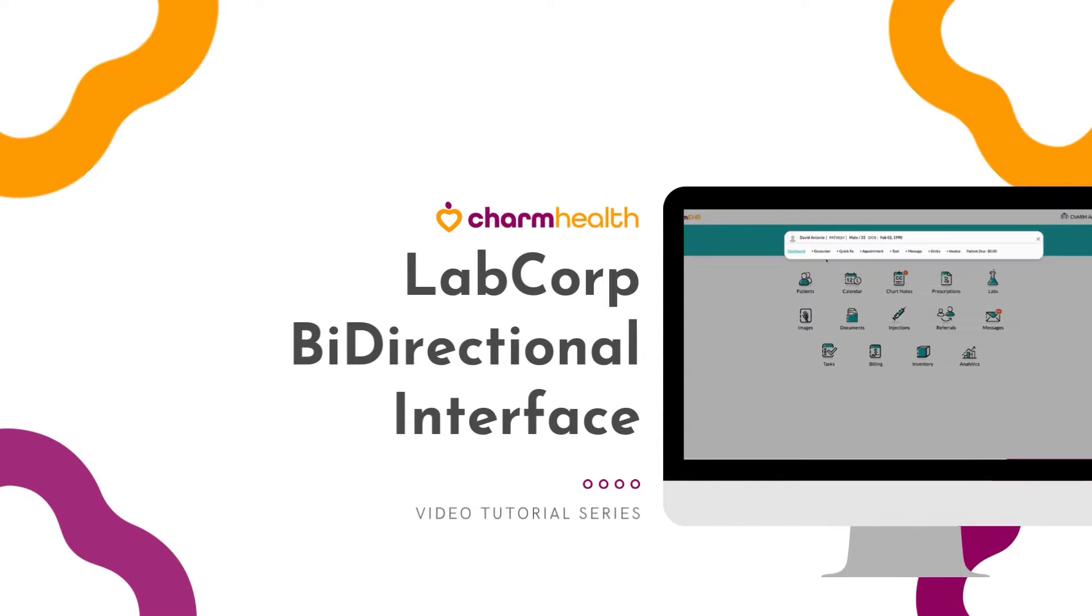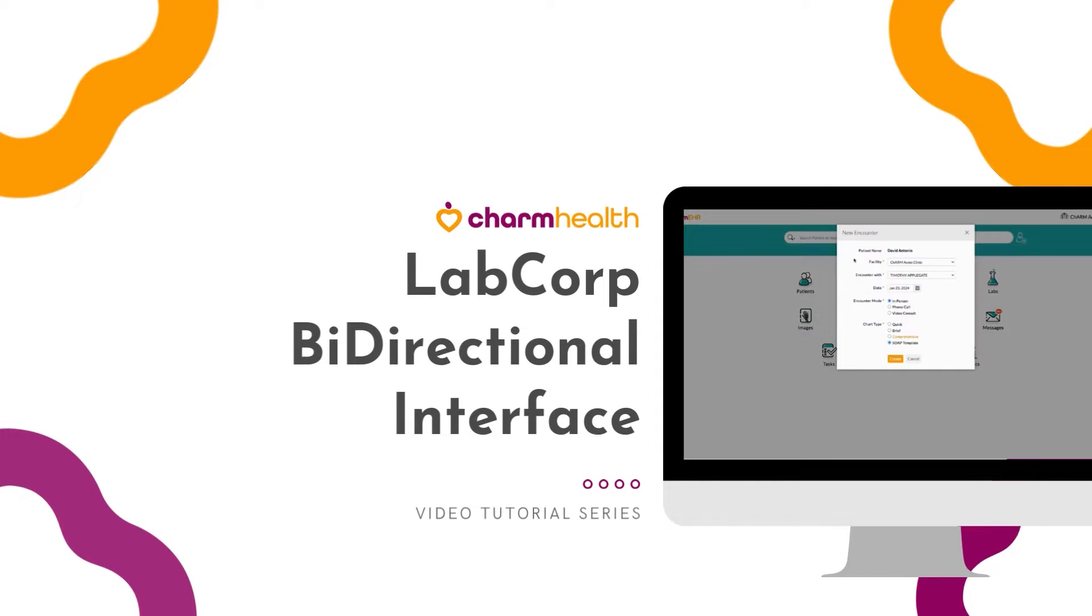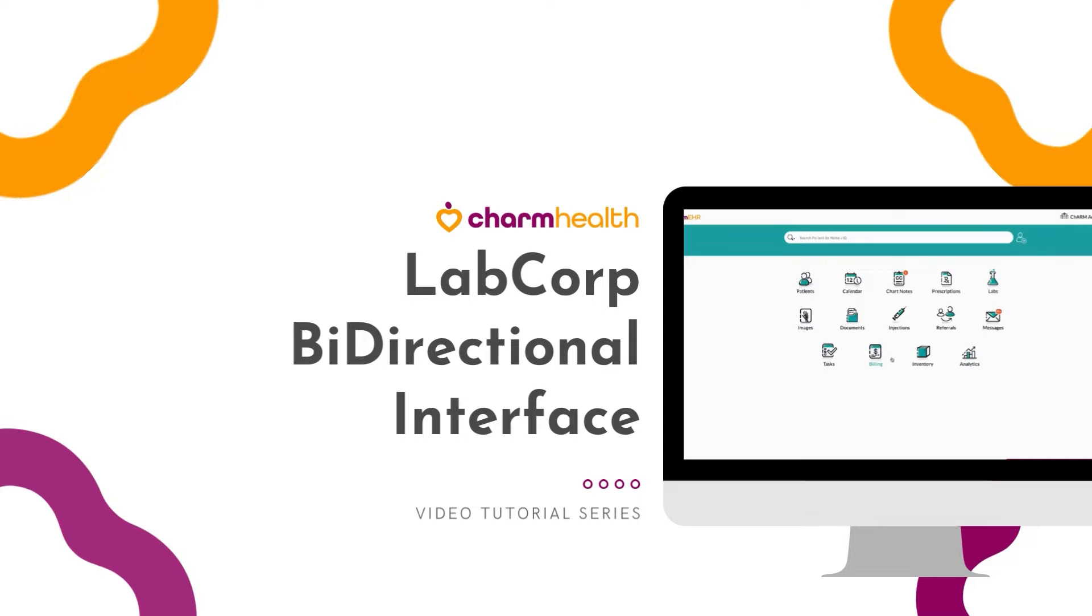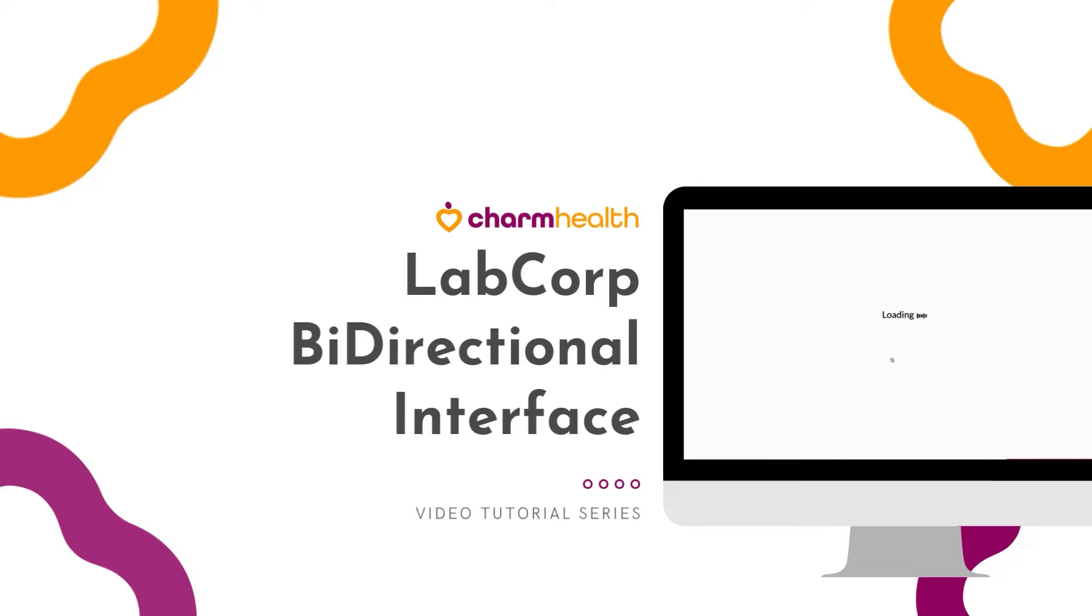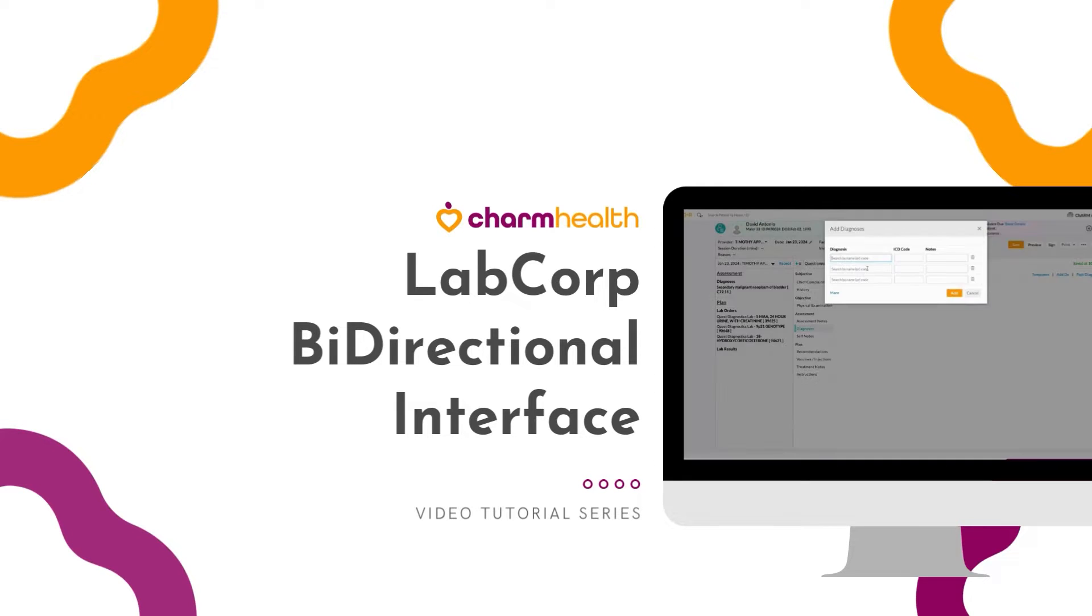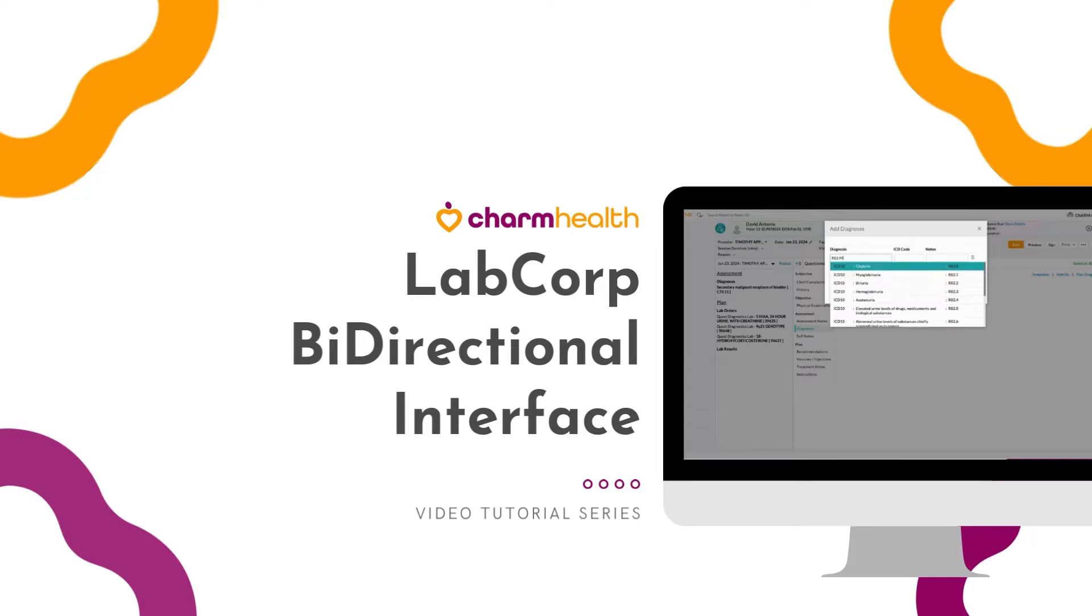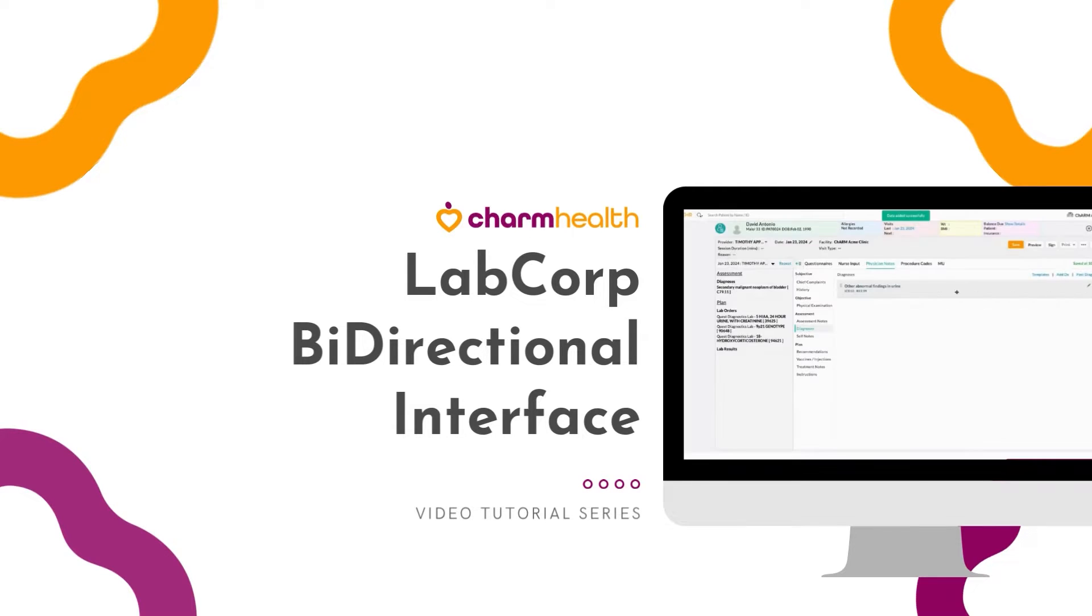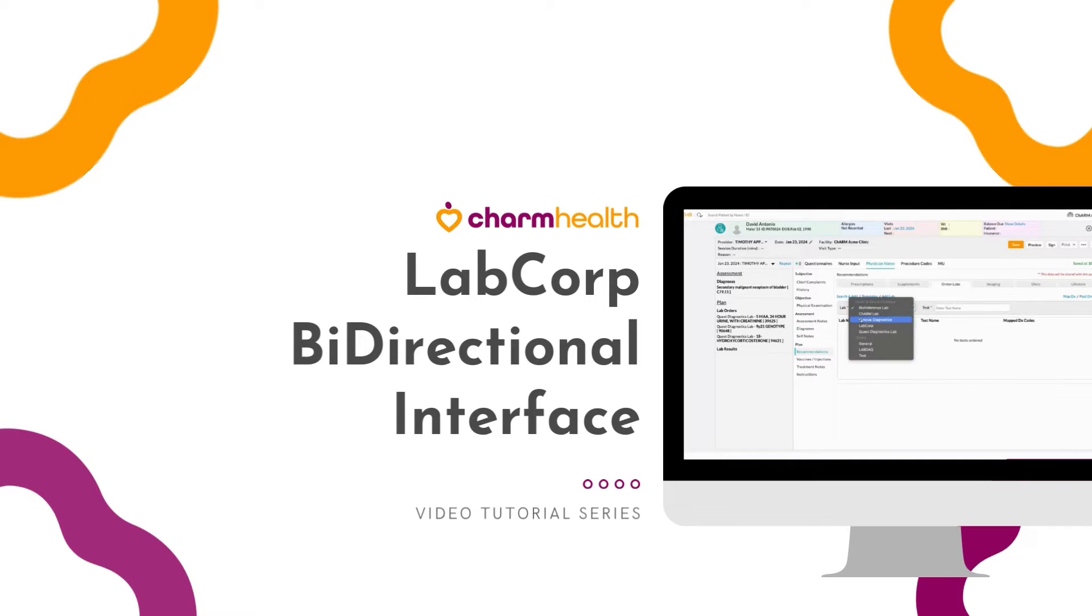Welcome to Charm Health, your medical records management and practice management application on the cloud. This video tutorial explains how to send orders and receive orders electronically through LabCorp and Charm Health.